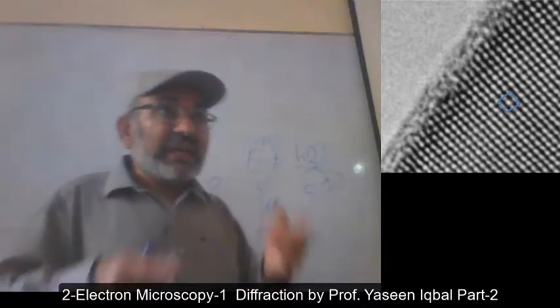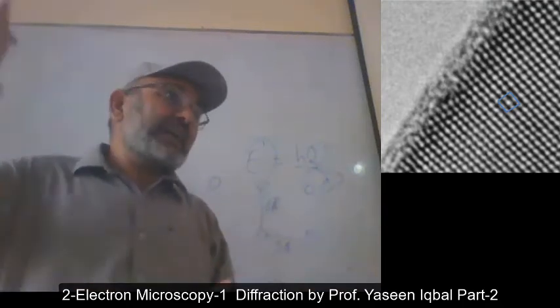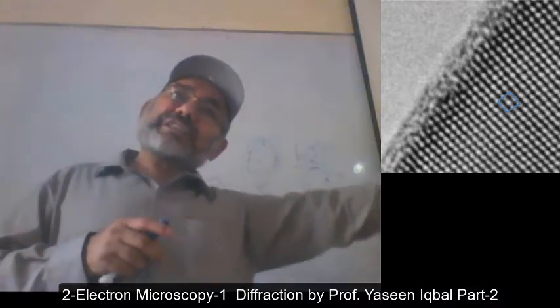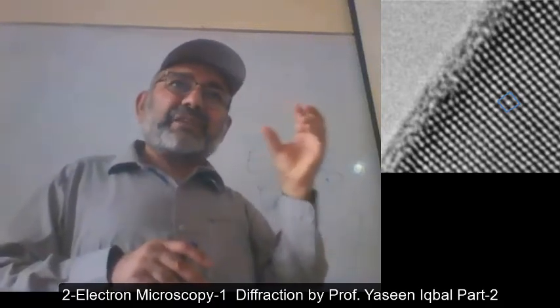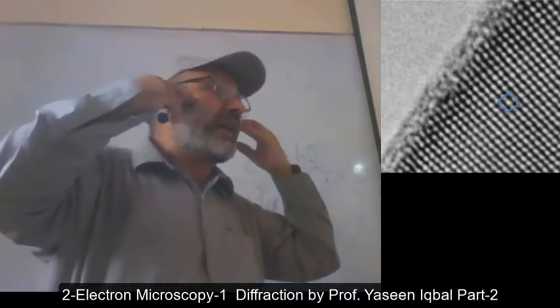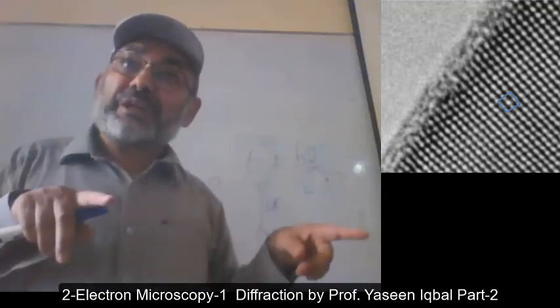And direct space is the reciprocal of the reciprocal space. So the larger will appear smaller and the smaller will appear larger. And the whole skill of microscopy, diffraction, is that you make invisible, unresolvable things resolvable. You have angstrom size, a few angstrom unit cell, and you are making it visible to the naked eye, because you are reciprocating the dimensions of the unit cell.